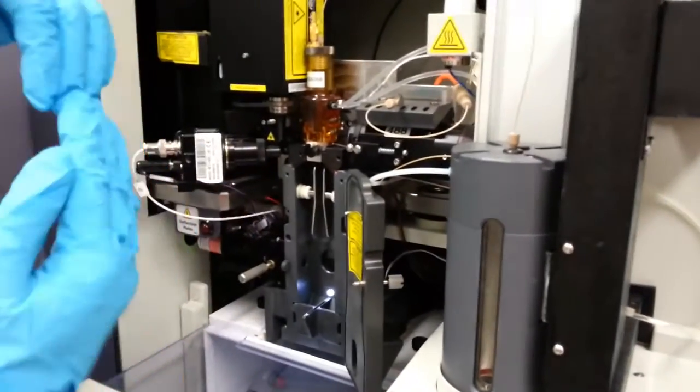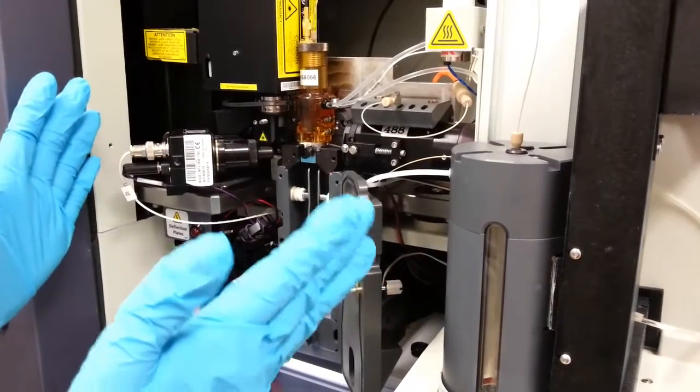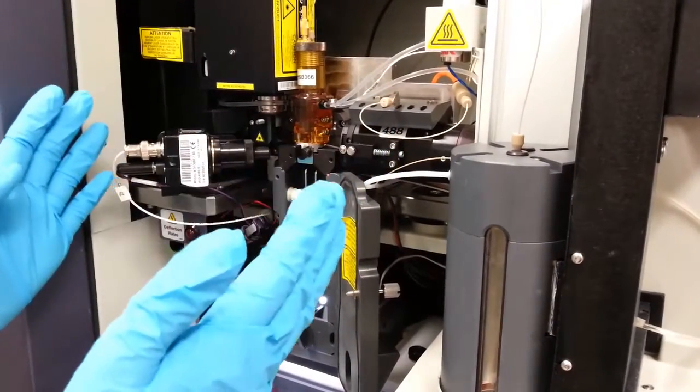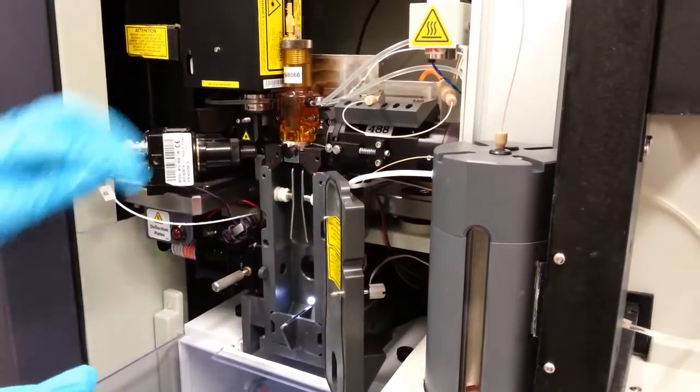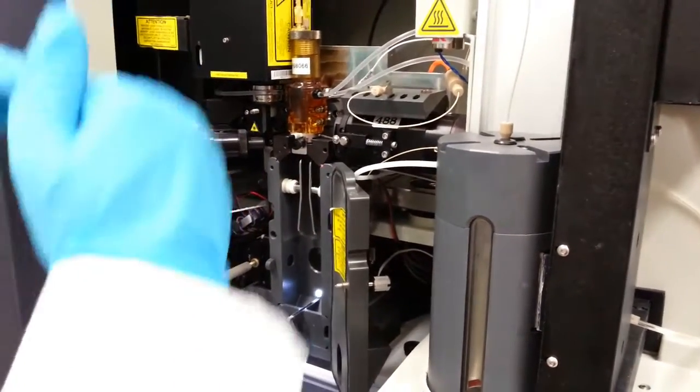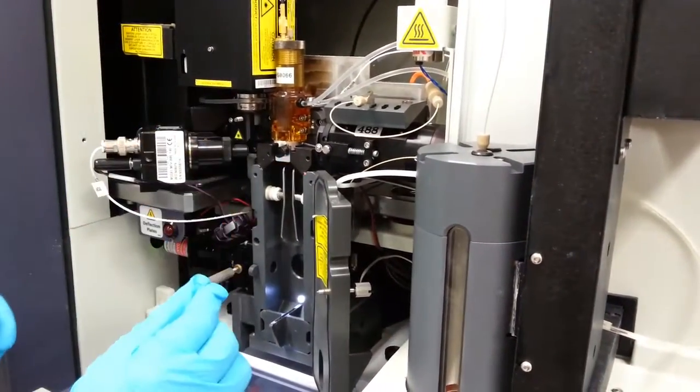On the inside you've got the cells that you've sucked up through your sample chamber, and on the outside you've got saline, salt water, that runs through at a slightly faster rate than your sample, and that causes a drag on the inner chamber. So the cells come through in single file.